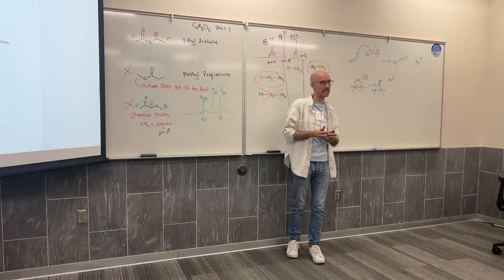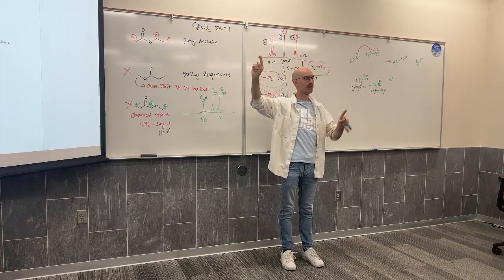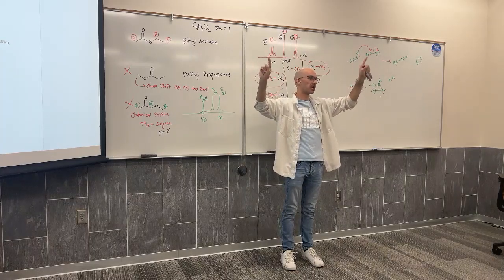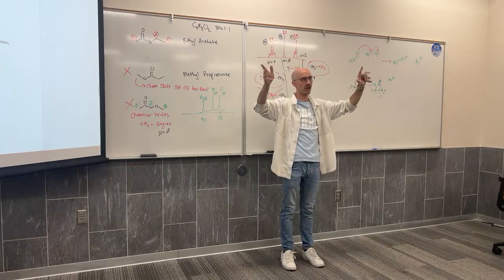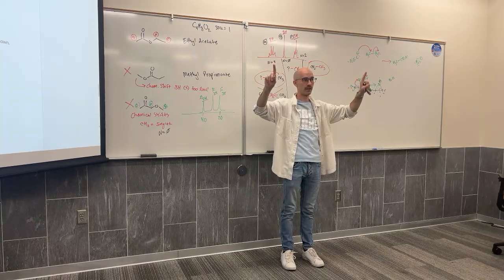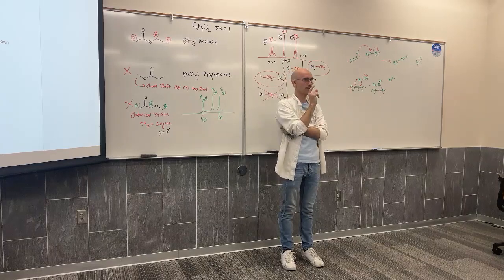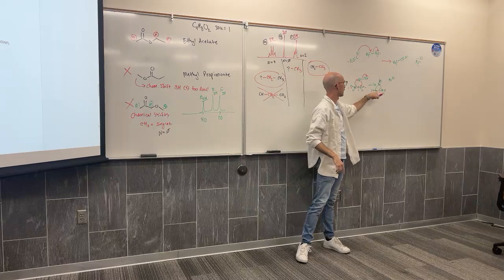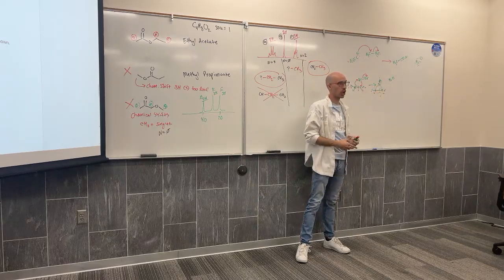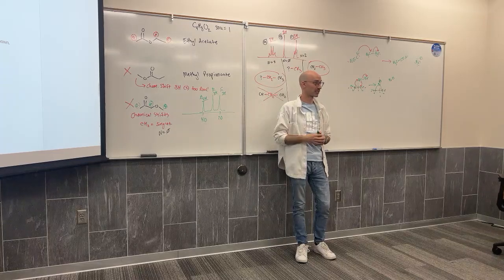When you said we'll see an alkene, you won't. But you will see sp2 CH above 3000, and you'll see CC double bond above 1600. That indicates the alkene, although it also has some indication of an aromatic ring. It's hard to know the difference in the IR. You won't see an alkene; you will see those two bond types. In the product, the CC double bond is gone. But you might see the CBr absorption, although that only absorbs in the fingerprint region, which makes it really challenging to actually label it.